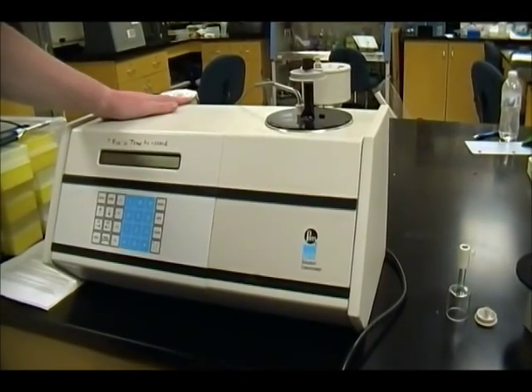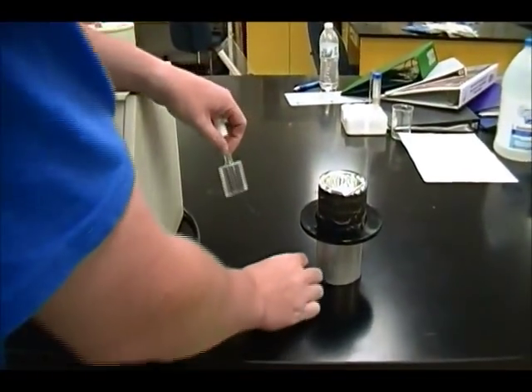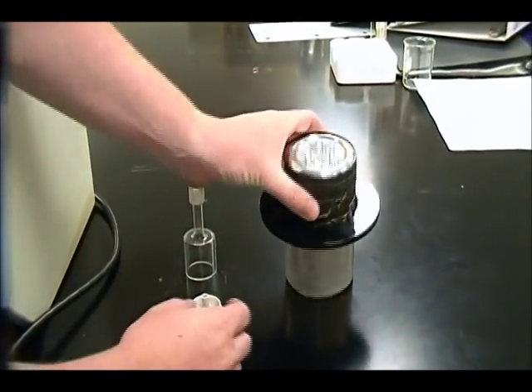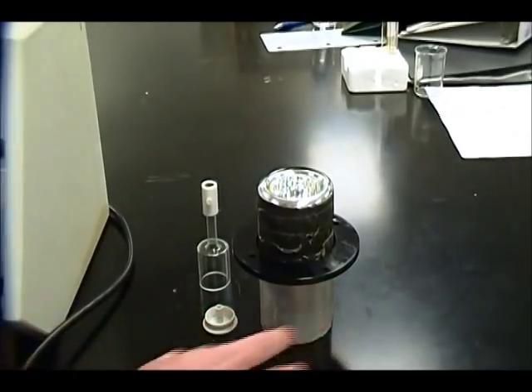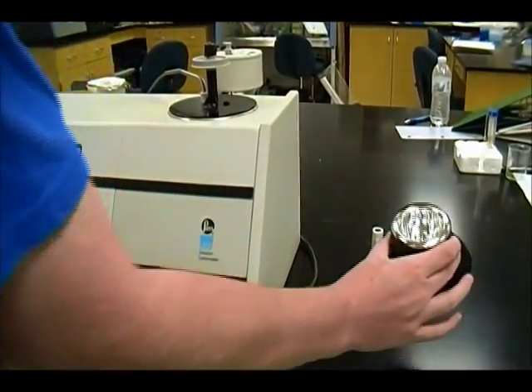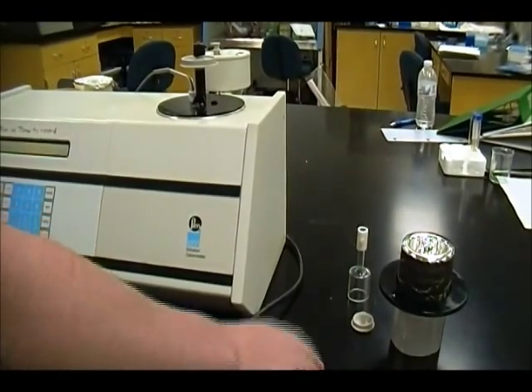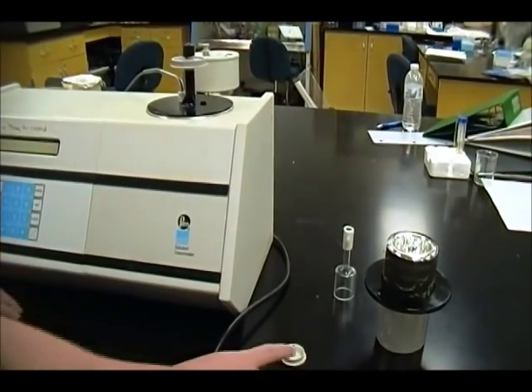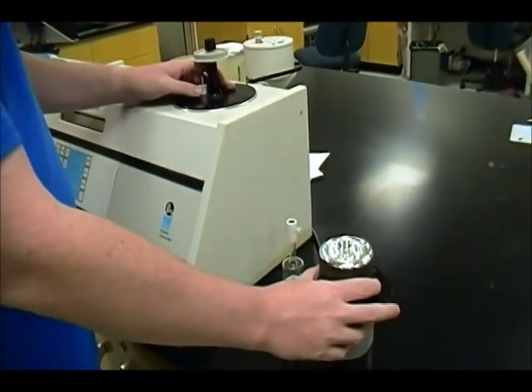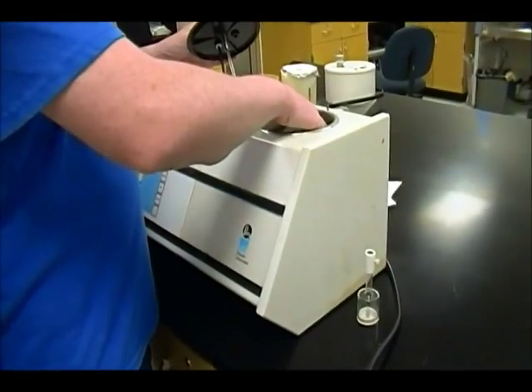This is the instrument we're going to be using in the experiment — this is the solution calorimeter. For the first step, you want to clean all of the pieces you're going to be using. This is your Teflon dish, this is what's called the bell in the procedure, and this is your Dewar. After you've cleaned everything and made sure you've gotten all the water out, you're going to add 100 mL of 0.1 molar HCl directly into the Dewar. Once you've done that, you'll measure out between 0.49 and 0.51 grams of the Tris compound and place it into the Teflon dish. Make sure to use the analytical balance when weighing this out to get as much accuracy as possible.